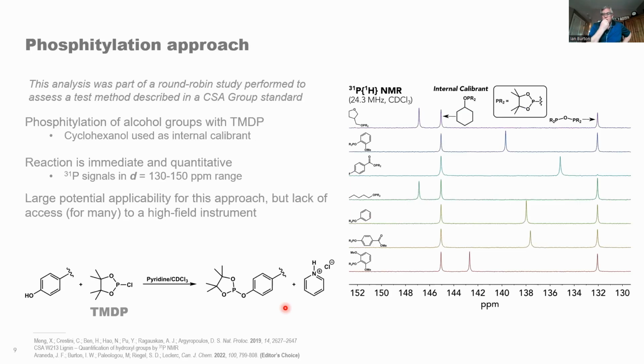So what we do is we've settled, or the industry has sort of settled, on a compound called TMDP. It's tetramethyl... what is it? That compound there.